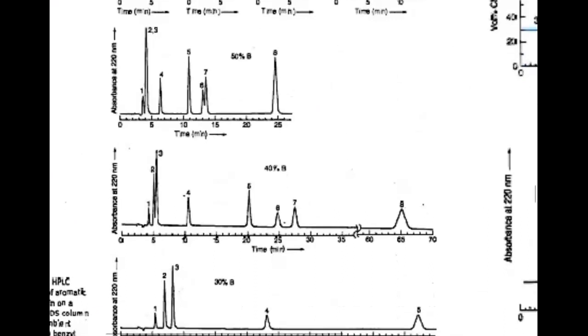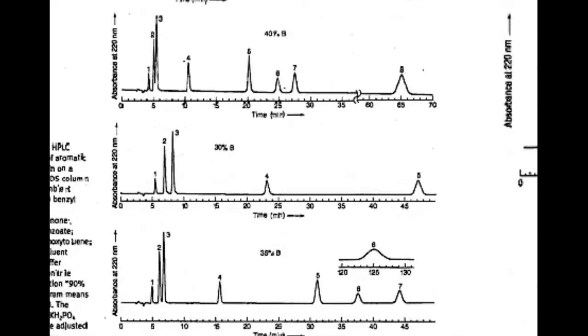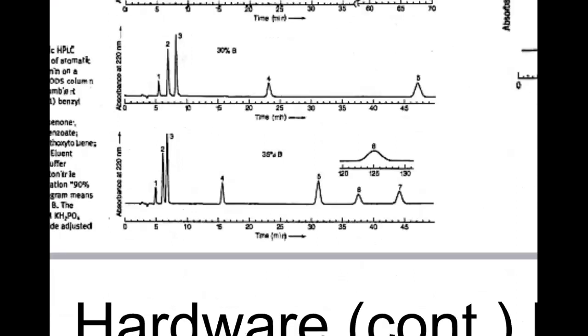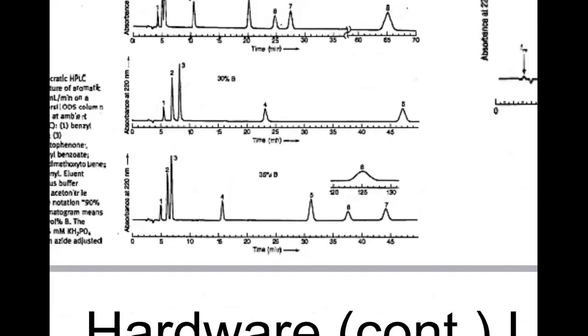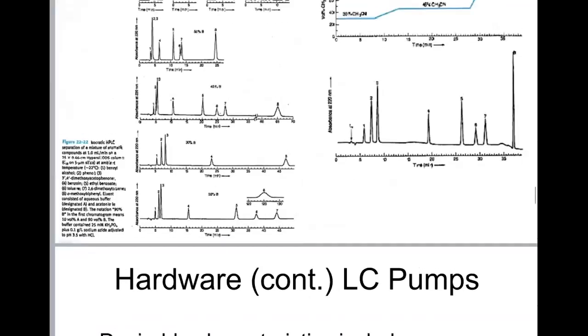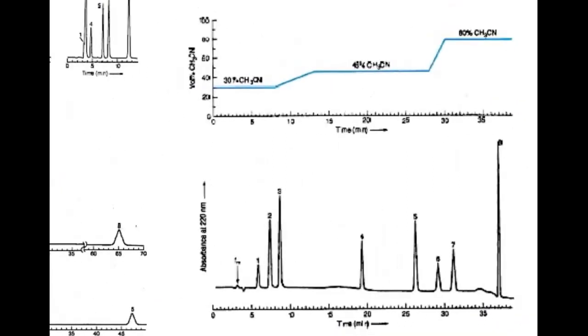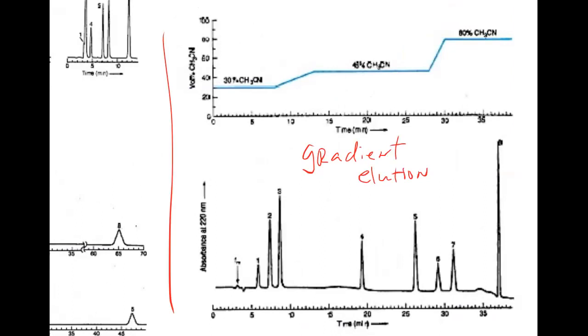The peaks slow down, they start to separate. We start to pull out these slight differences in polarity between the analytes at the expense of time. See, I like to separate the molecules, but I still don't want to wait around for an hour and a half to see things, right? So why don't we do gradient elution? And that's actually what's shown over here.